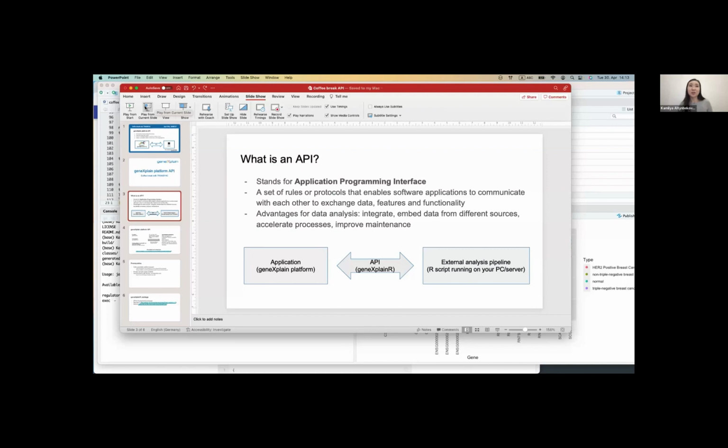So what I wanted to show and demonstrate today is that, first of all, there are a lot of ways in which you can interact with our platform. So not just the web interface, but also via different tools, like the R package, the Python package, the commands tool. So we are trying to give our users as many ways as we can to do the analysis.